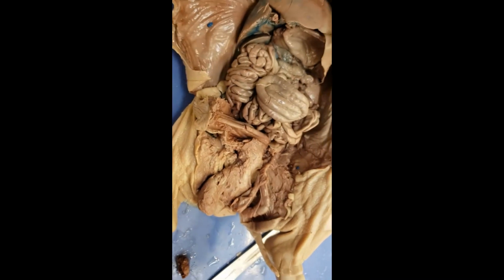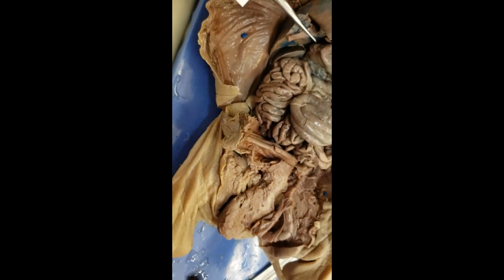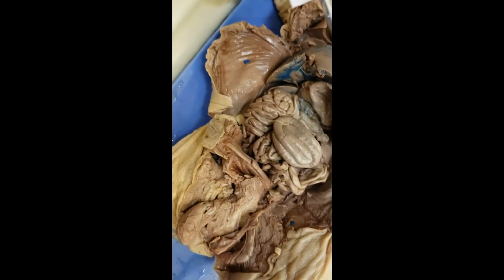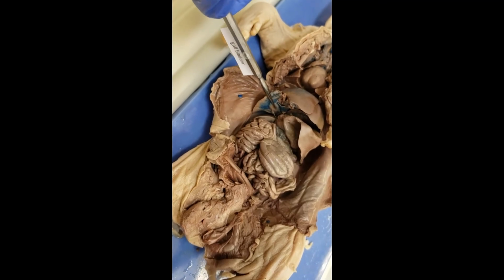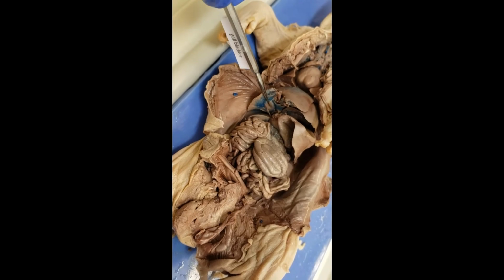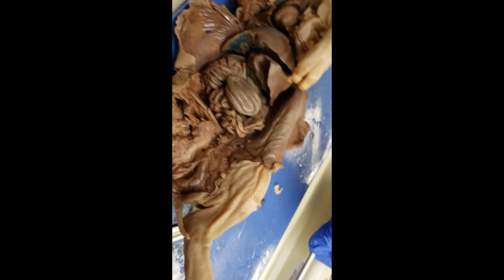The gallbladder. Now, the gallbladder likes to hang out with another organ, and that will be the liver. So we have to turn to the liver, and then see a little sac. Sometimes this is colored green, ours is not. But where I'm pointing to right there, that is the gallbladder. So right there at the tip of the little blade here. Pointer thing. It's your gallbladder.